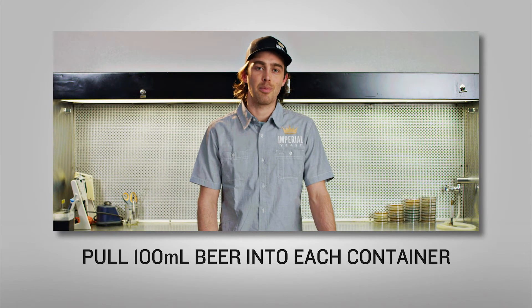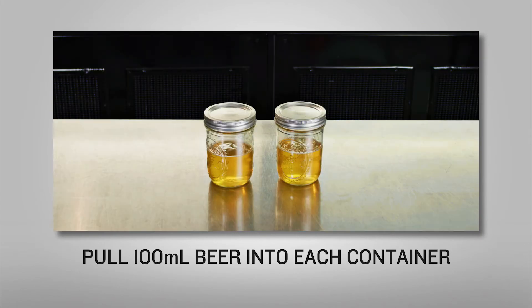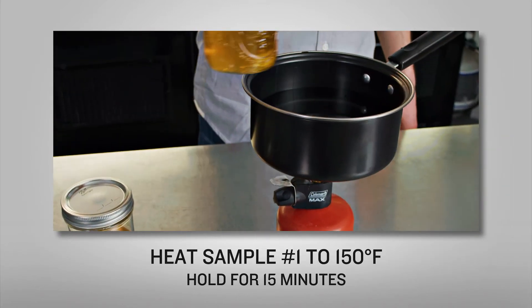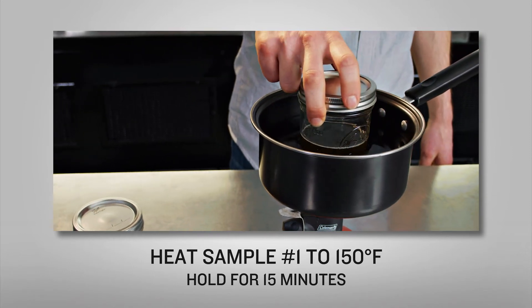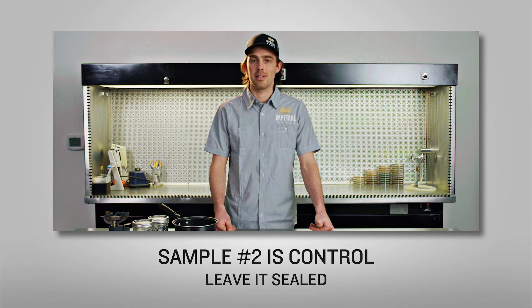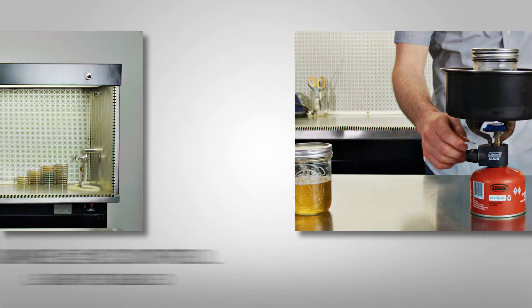First, we'll pull two separate 100 ml samples of beer from the fermenter into those sealable containers. Next, heat sample 1 to 150 degrees Fahrenheit and hold it sealed for about 15 minutes. At the same time, hold the second sample at room temperature, also making sure to keep it sealed.